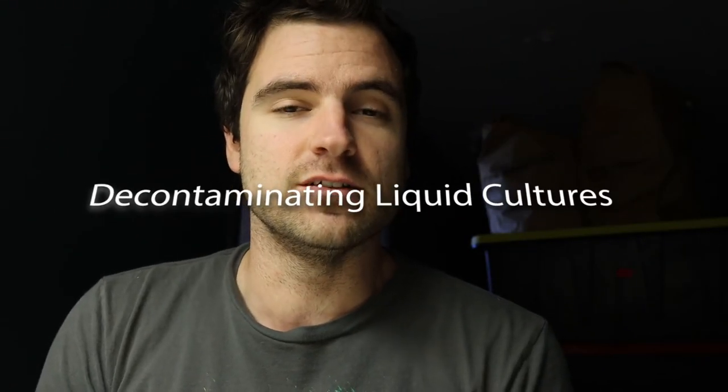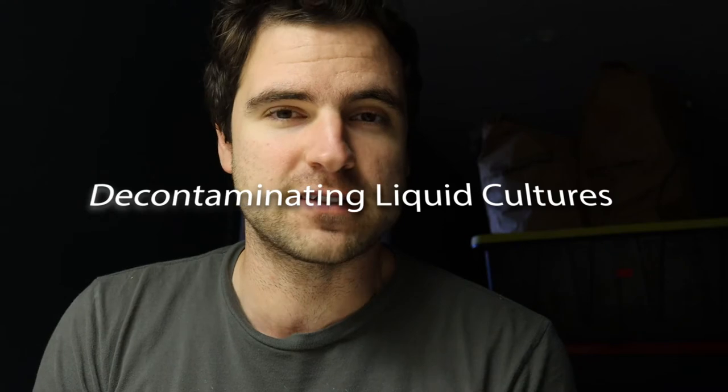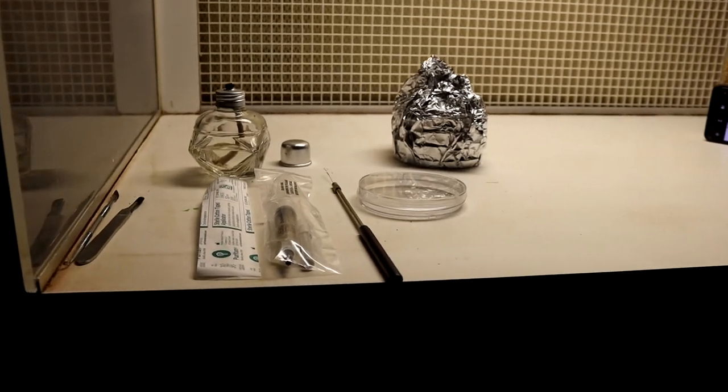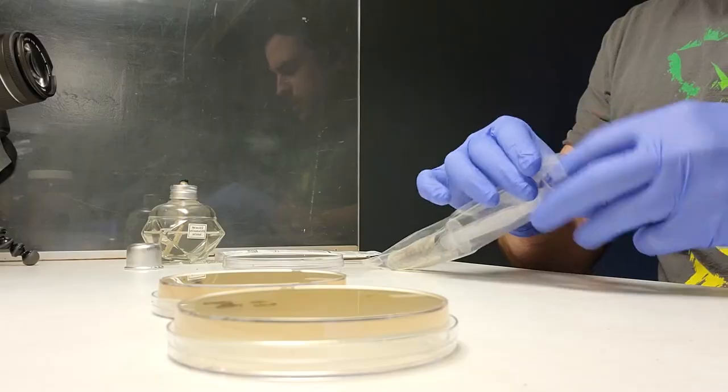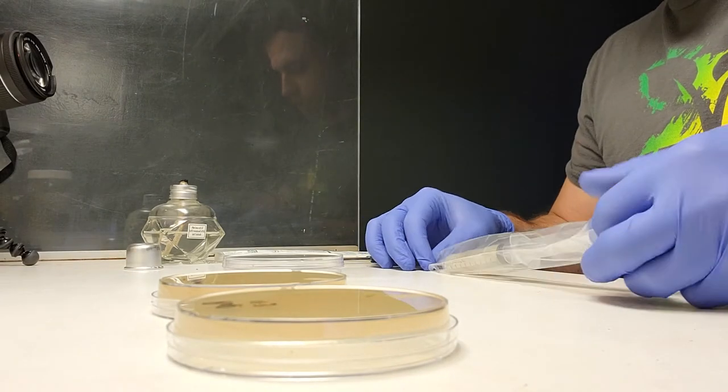No culture is too contaminated — remember that. Hey guys, it's Andrew from Of Mice and Mycelium, and today I'm going to show you how to isolate a selective strain of mycelium from a contaminated source.